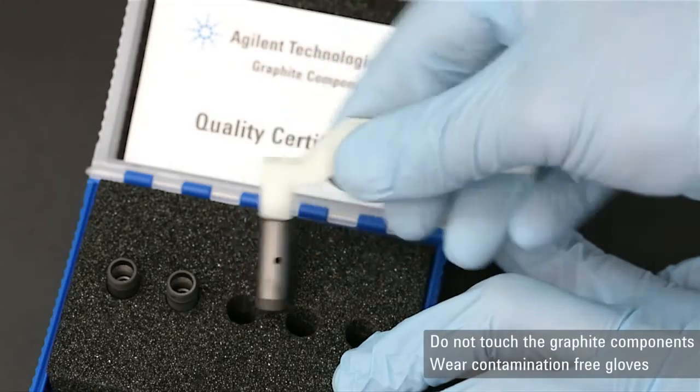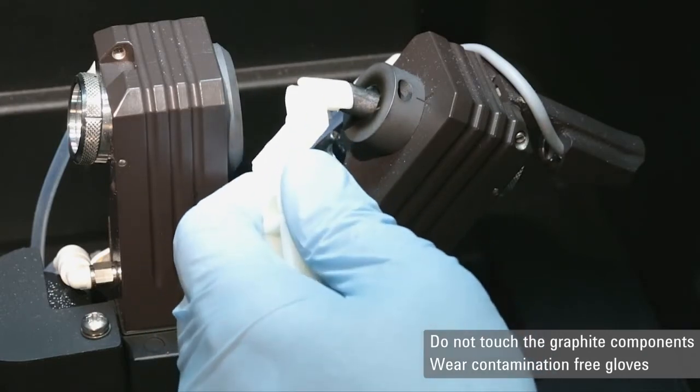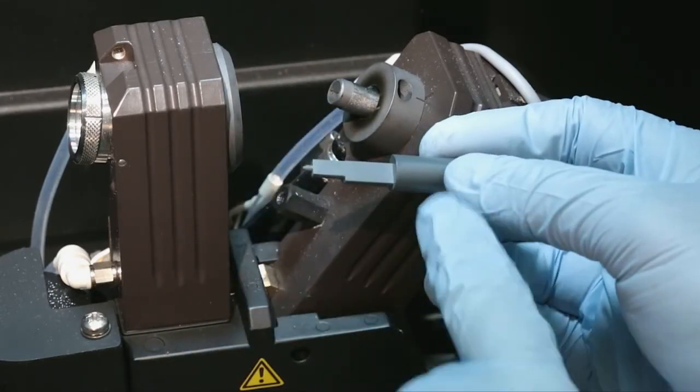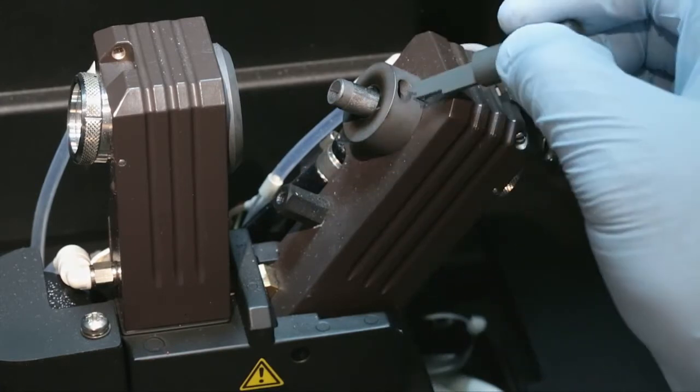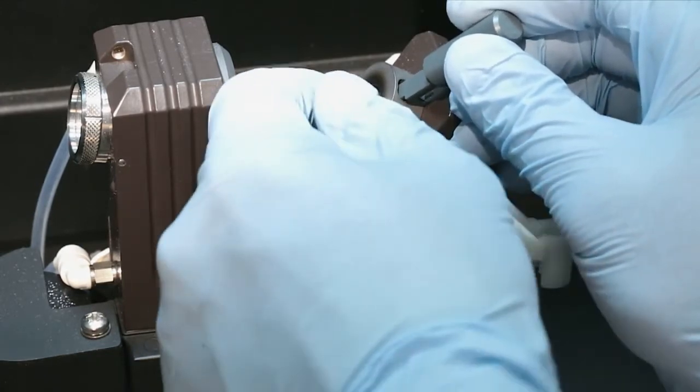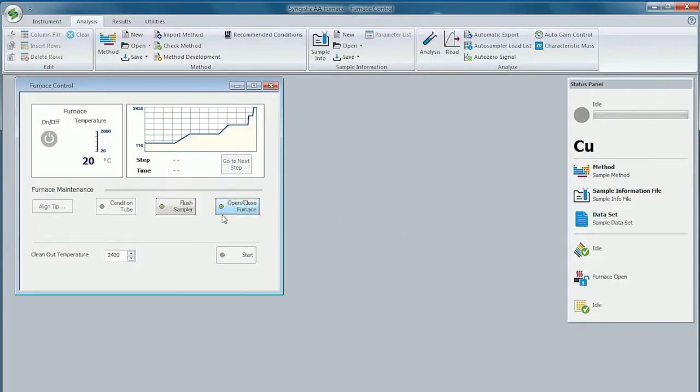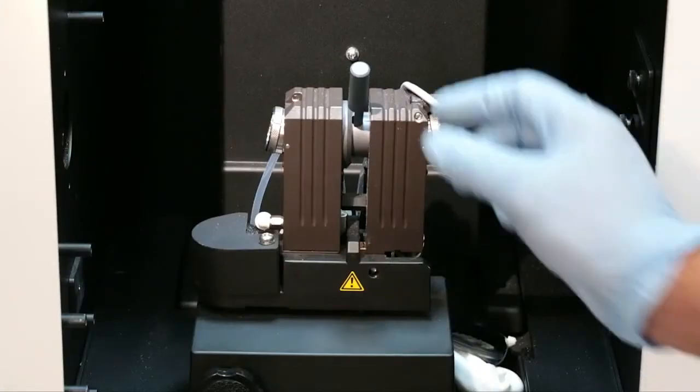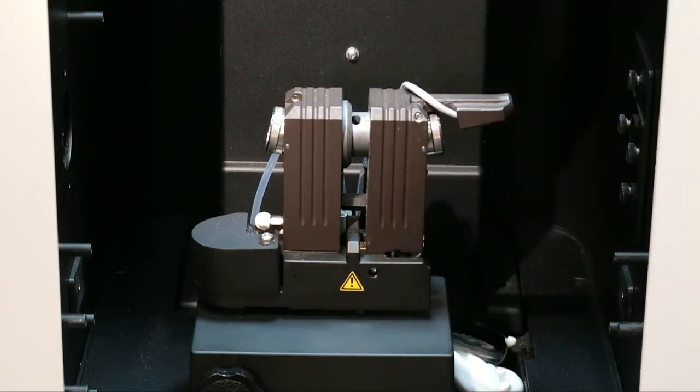Insert the new graphite tube into the right-hand side of the furnace contacts. With the flat side of the alignment tool facing left, insert the tool into the sample injection port and align the graphite tube. Click the open/close button in the furnace control window to close the furnace. Remove the alignment tool and check the alignment of the furnace.